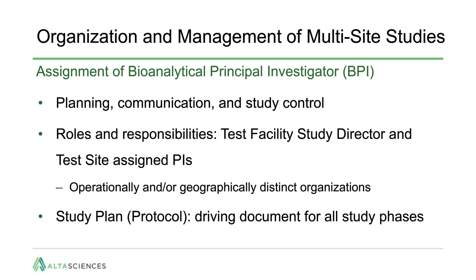For scientists at the test facility, the assignment is usually adjusted to contributing scientist or project scientist. The study director is responsible for the GLP study. The GLPs and multi-site guidance provide a framework to ensure appropriate study planning, communication, and study control. Bioanalytical principal investigators are assigned for the bioanalytical phase, and there could be several assigned, depending on the analysis and/or test sites identified. The study plan or protocol is the driving document for studies with an assigned study director.